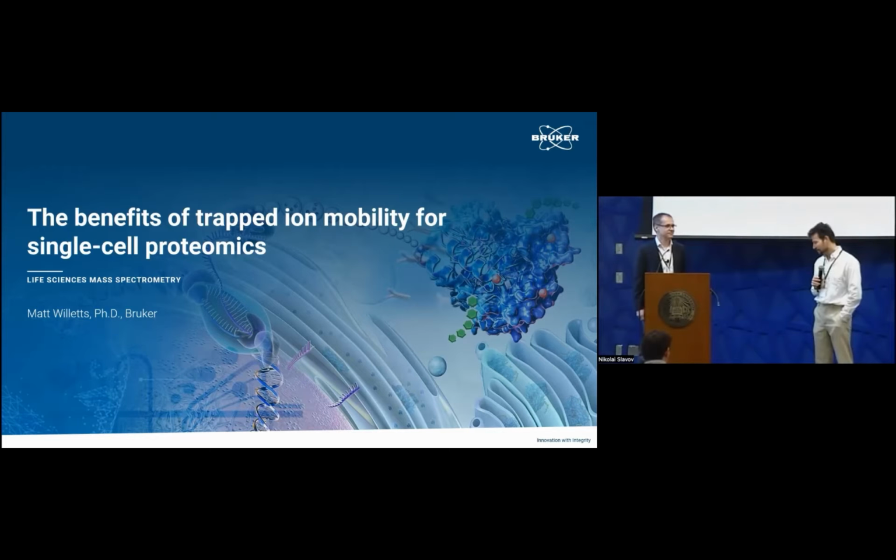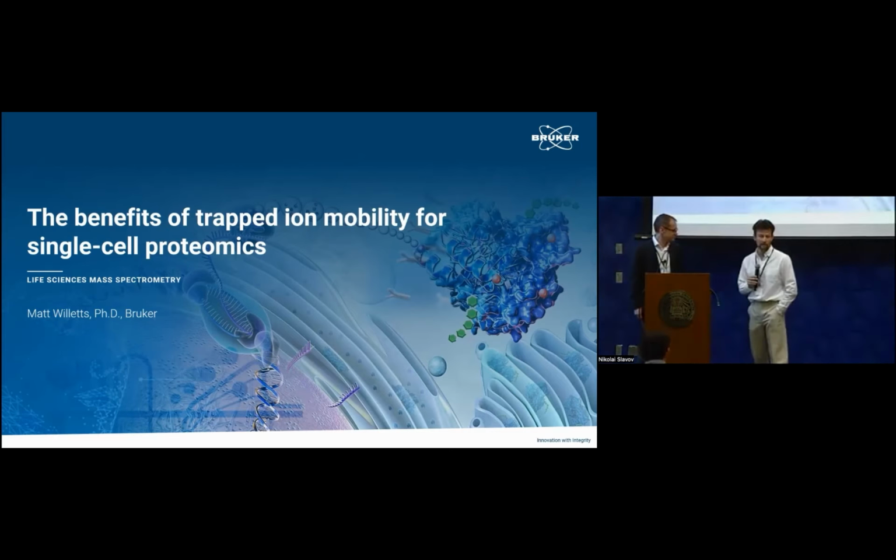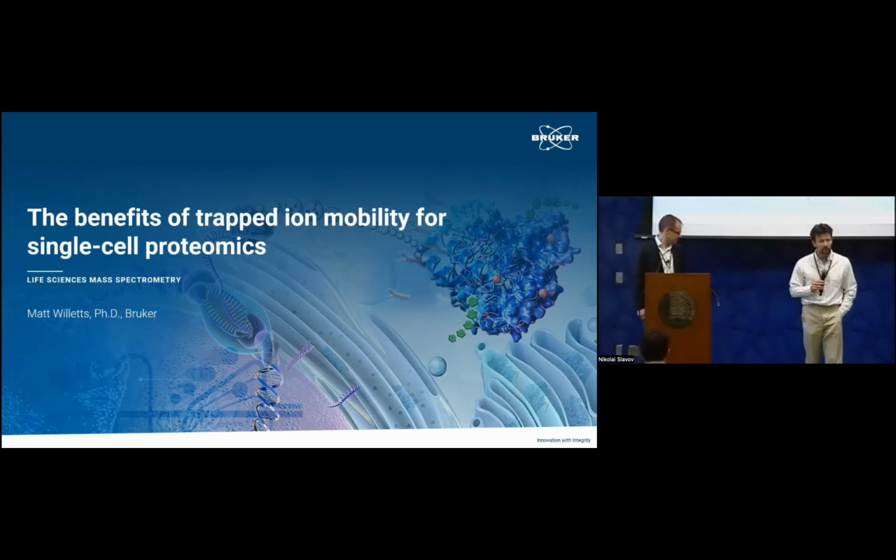In particular, I've learned quite a bit about the topic of his talk today, which is ion mobility, trapped ion mobility. It's a form of separating ions, and it will come as no surprise to this community that high-performance separations are very, very useful for protein analysis.